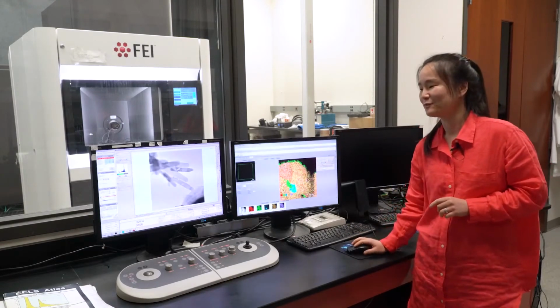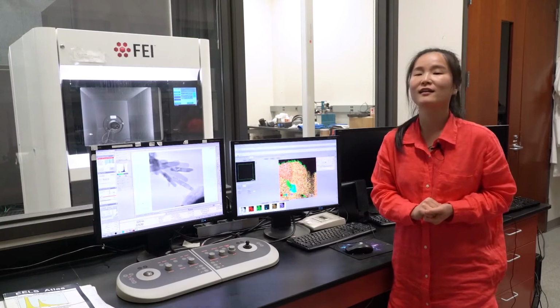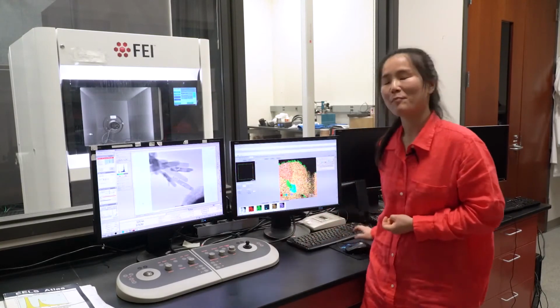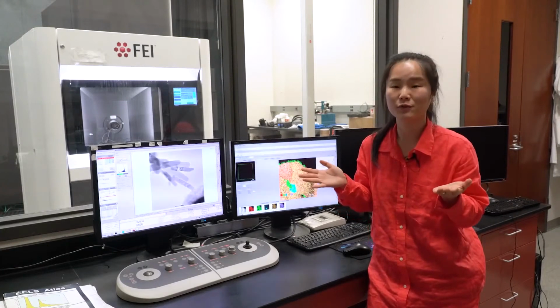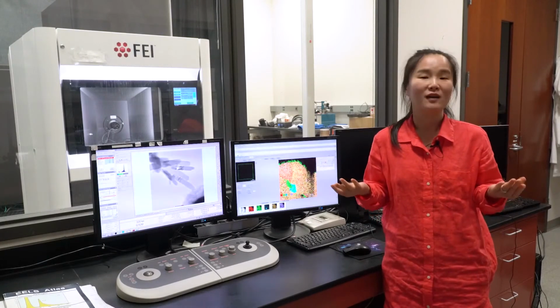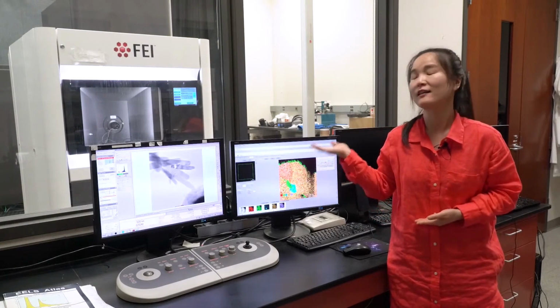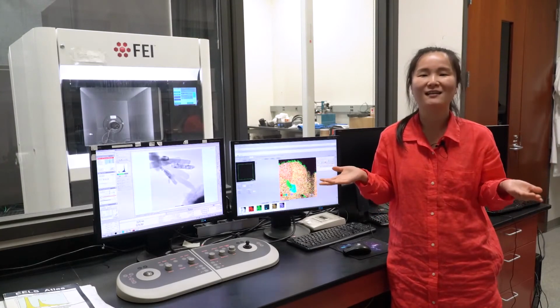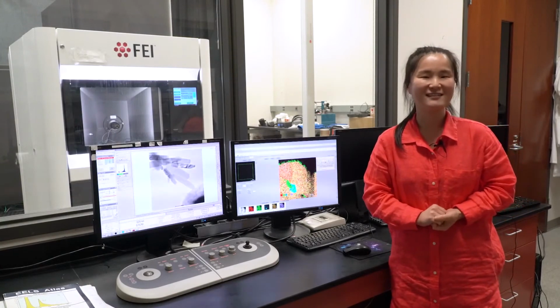The really good thing is we can observe the sample in operando. Operando means we are looking at the materials while they are operating or working. Here I have lithium-ion battery materials, and lithium metal is at the bottom. When lithium is inserted into the materials, we can track how the structure and chemical composition change. These kinds of studies are very useful to improve battery performance, like to make batteries that last much longer or recharge more quickly. Scientists use this electron microscope to study all kinds of materials beyond batteries, from catalysts and metals to semiconductors and solar cells. I hope you enjoyed this short tour, and I look forward to talking with you soon.